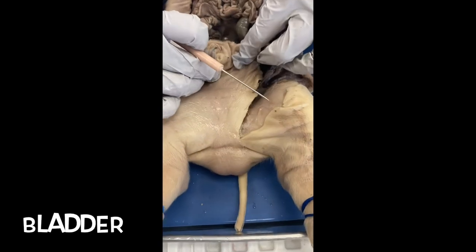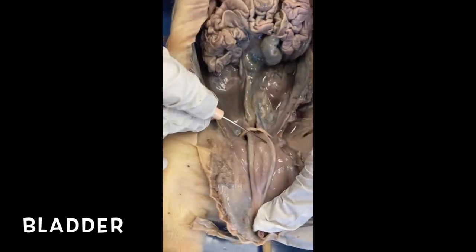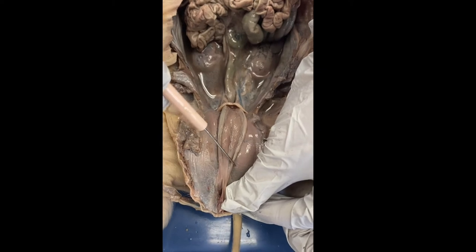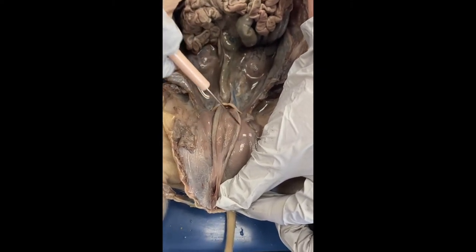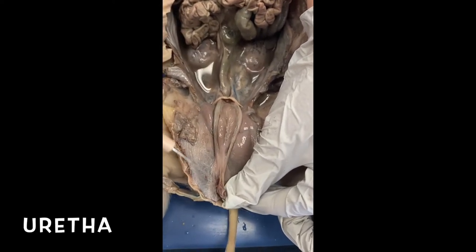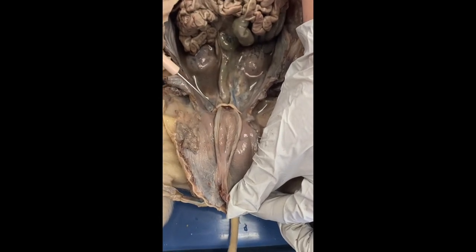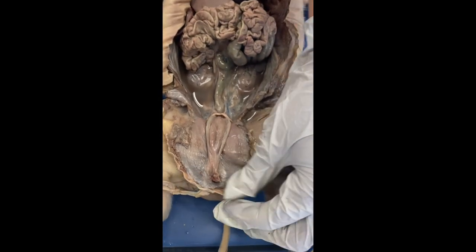Here is our bladder. So if you pull this back and you look at where it is on the pig, the bladder is here. It's this entire area here. And I'm going to show you in a moment. This is your ureter. These are tubes coming from the kidneys, actually. They're bringing the urine. And then you have your urethra where you'll actually urinate. All of these are tubes right here. They're attached to your kidneys inside of you. And I'll show you that in a moment.